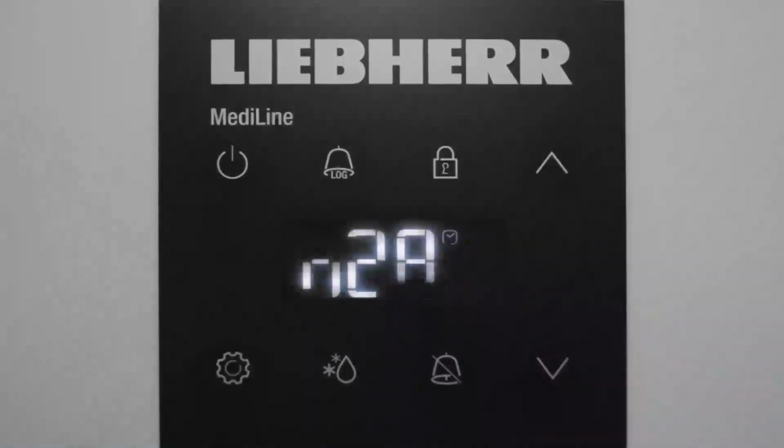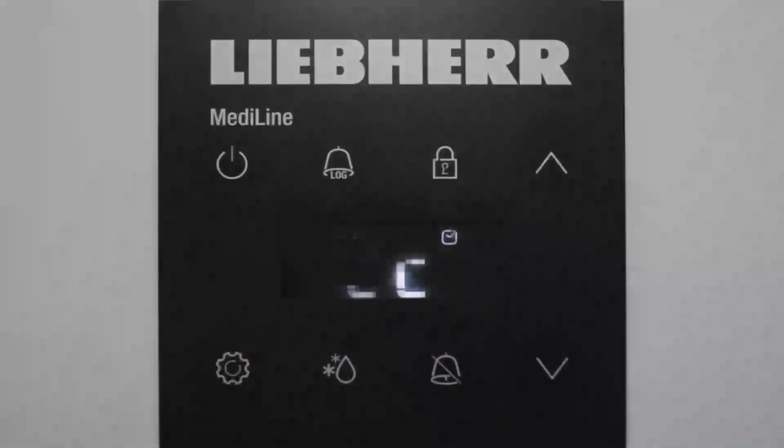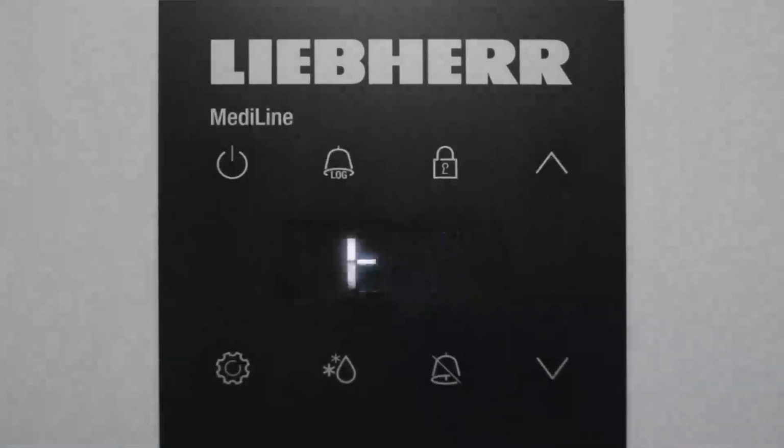Once you have your correct date and time selected, you then depress the bell button with the diagonal line once to bring you back out to the time setting within the operations.